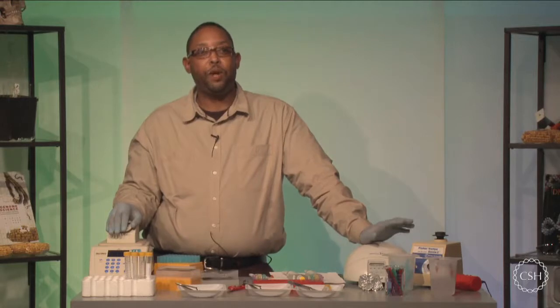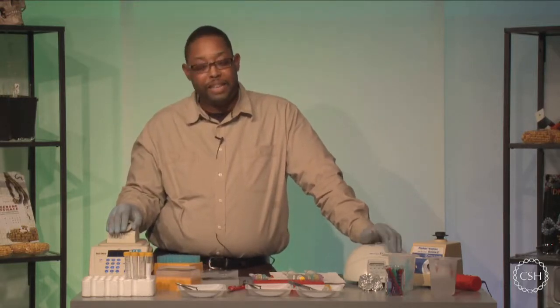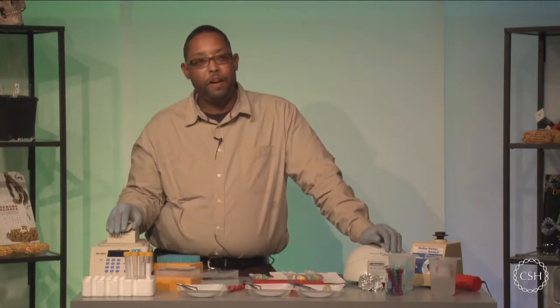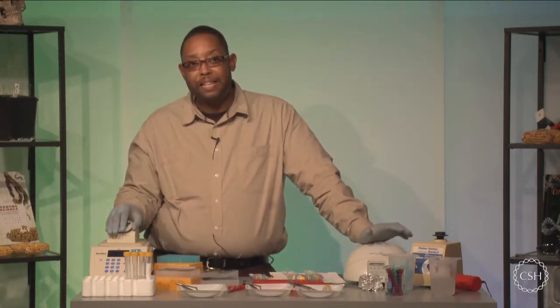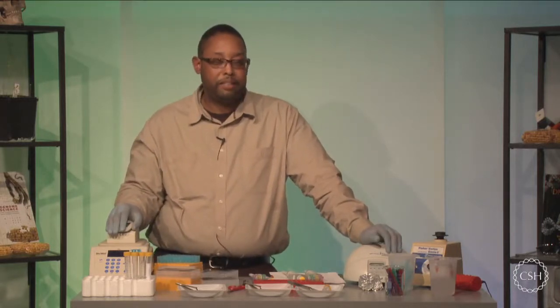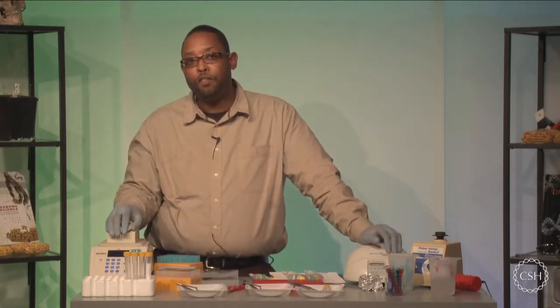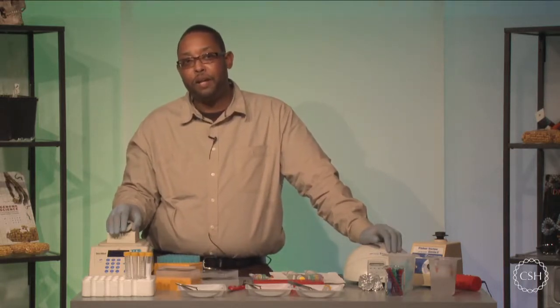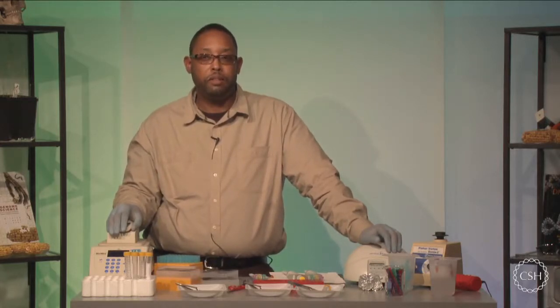So how would I determine the species of a sample? Well, after we physically isolate the DNA and amplify the actual barcode or the target gene, we'll then have to blast samples against a database at NCBI, or you can blast samples against the BOLD database, and you can identify species that are already known. Or if your species barcode is not available, you can essentially identify a new barcode for new entry.